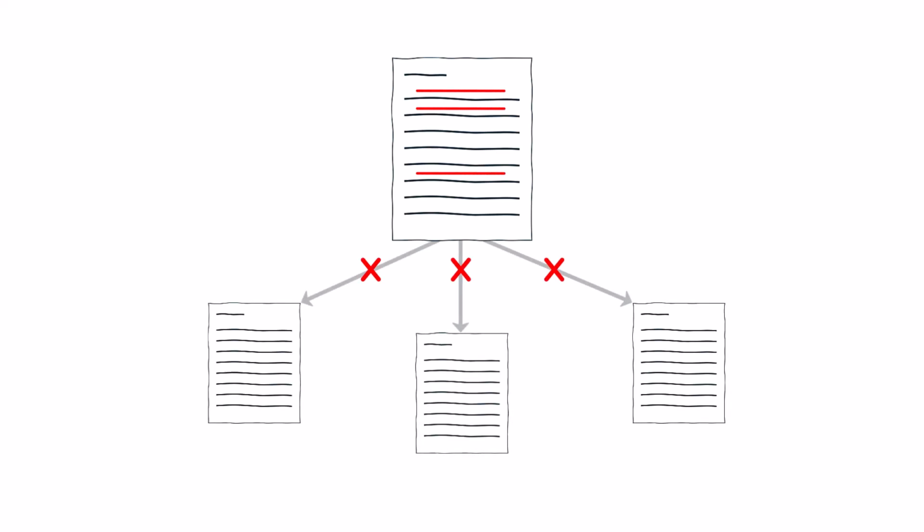You can think of it like having a list of instructions on paper, and any time you need to use the instructions, you make a photocopy so you don't affect the original. And any changes made to the original will not be linked to the photocopy, as you would expect. Well, the same applies to any maze. If someone were to come along and change the original protocol file, it would not affect the protocol that you're working with, as it's merely a copy of the original.